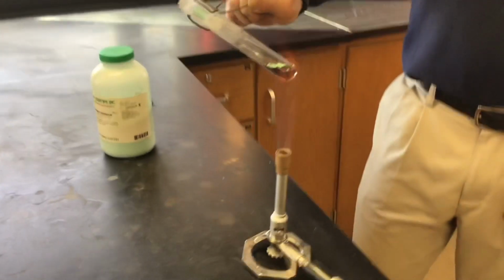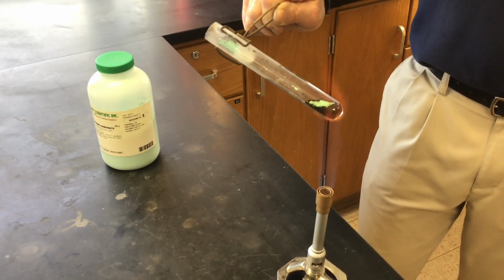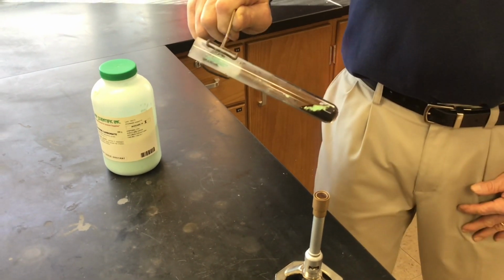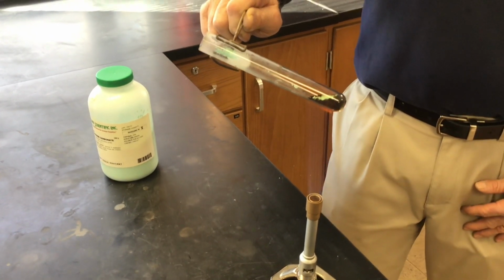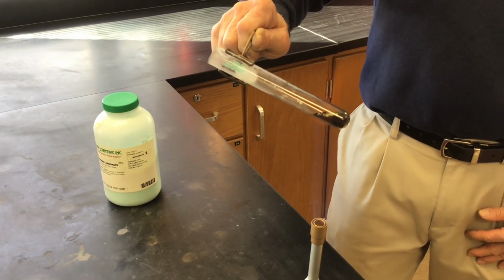Yeah, in case something were to come flying out the end of the test tube, we don't want to hit the lab partner. And I understand Mr. Hevel has experience with a lab in Chem 1, I think, going like that, and wasn't it years ago, yeah. Test tubes blowing up, it was interesting.